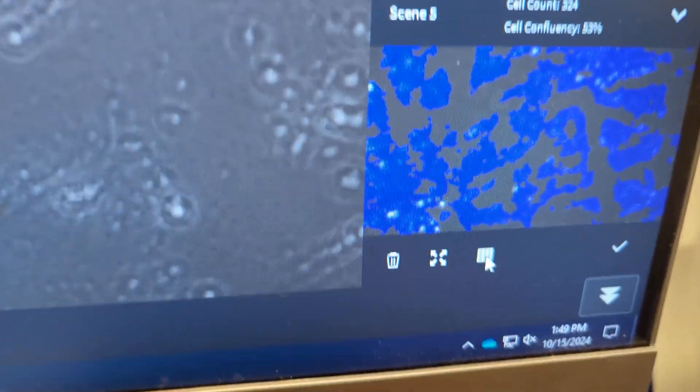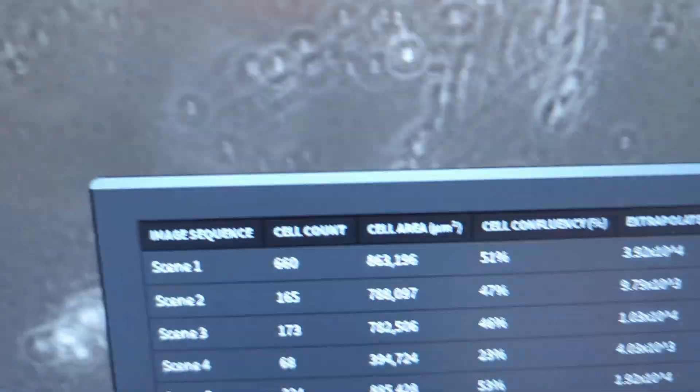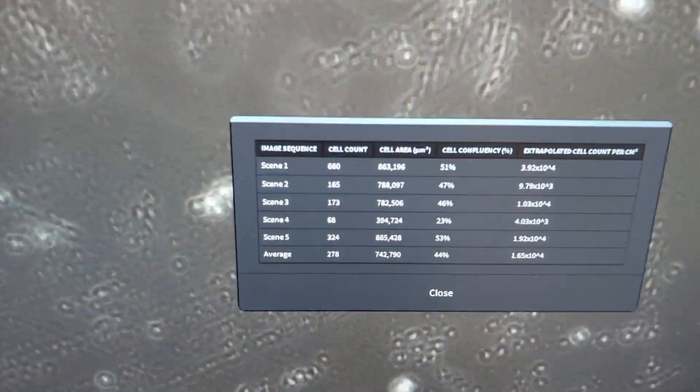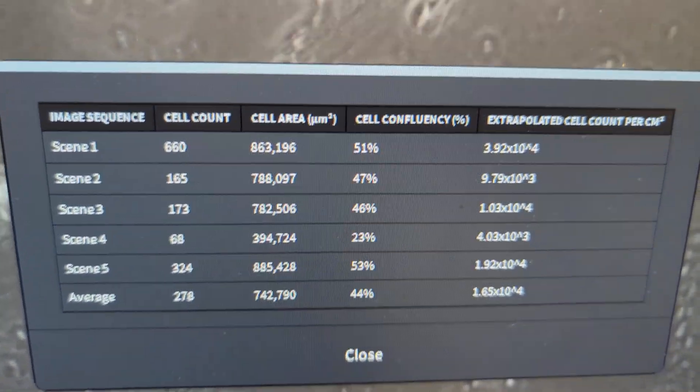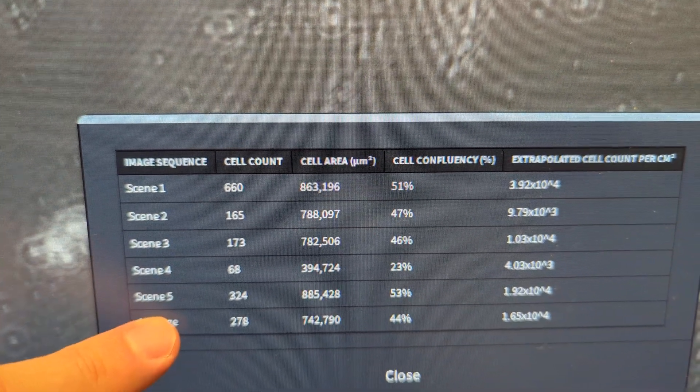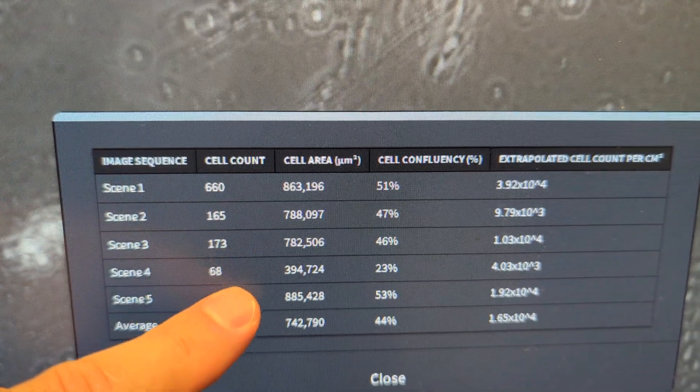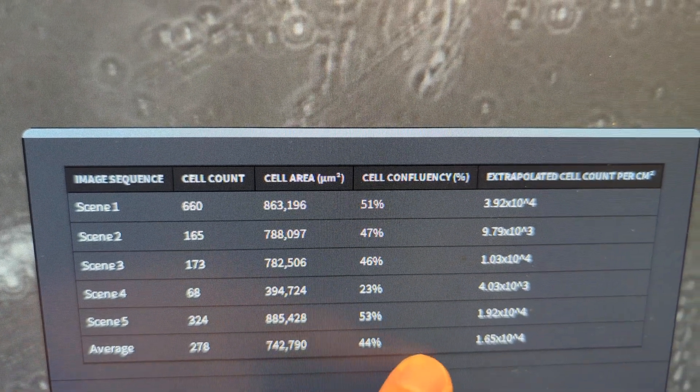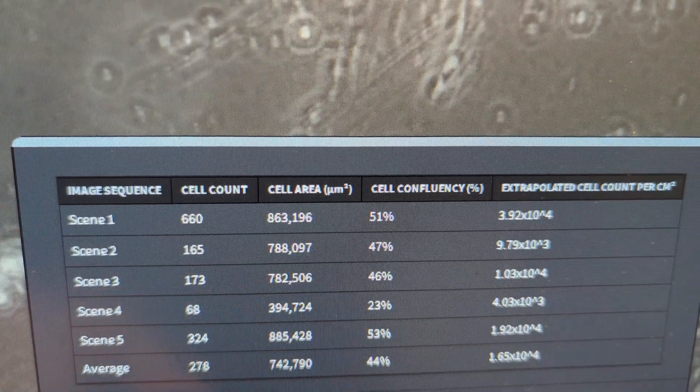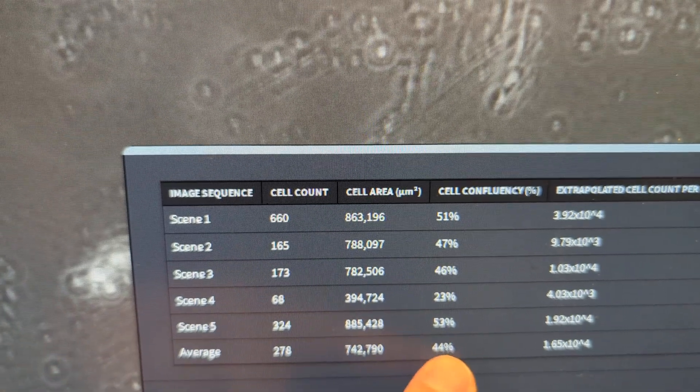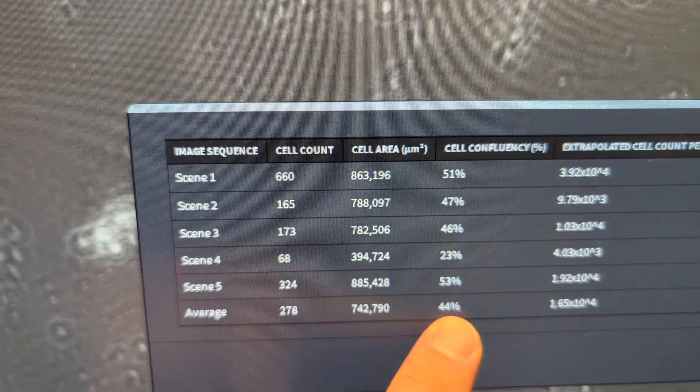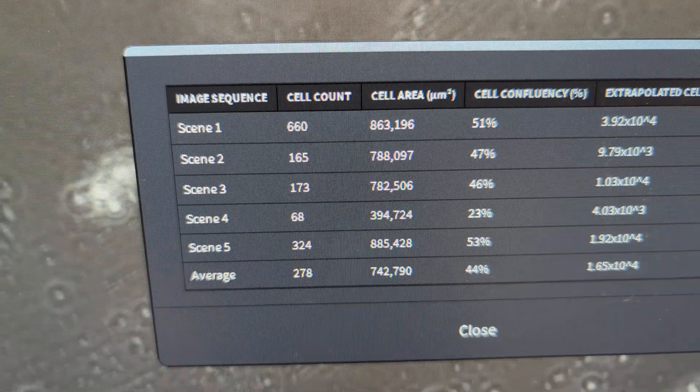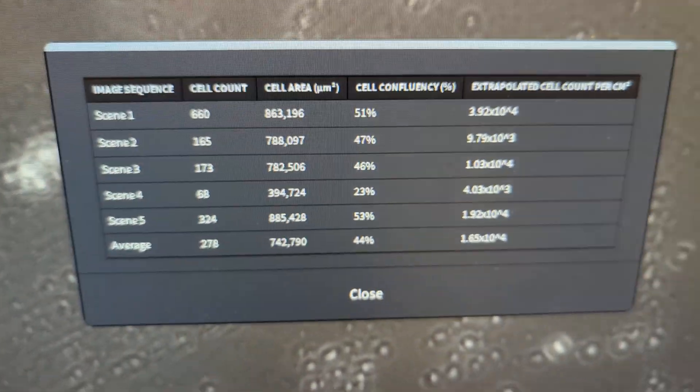So I click on this chart, and this pops up right in the middle. And now I can see the five scenes, the five images I took, each one's individual data, and the final average of all five along the bottom. So we've got 278 average cell count, 44% cell confluency in that, let's say, that plate or that dish.